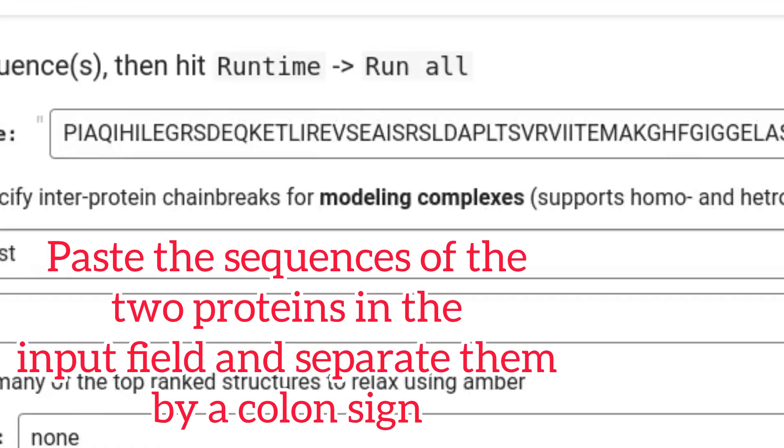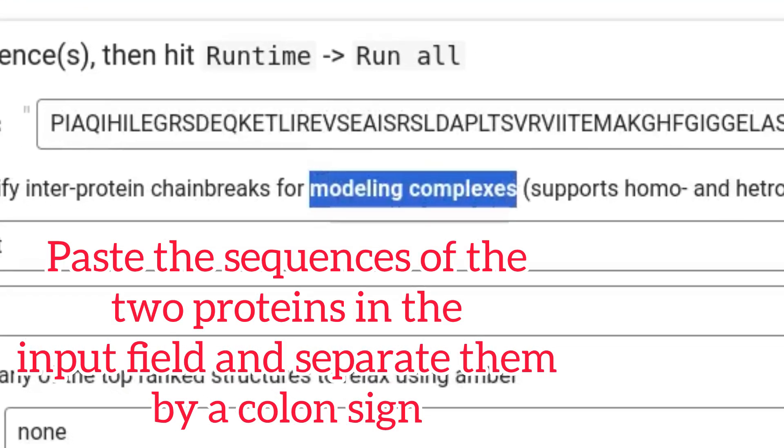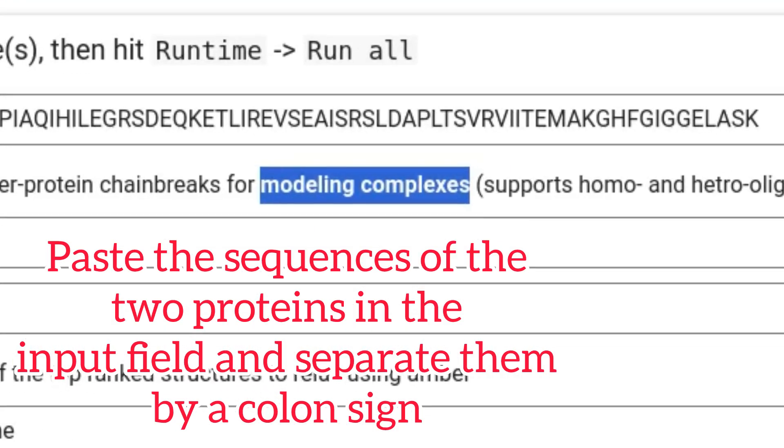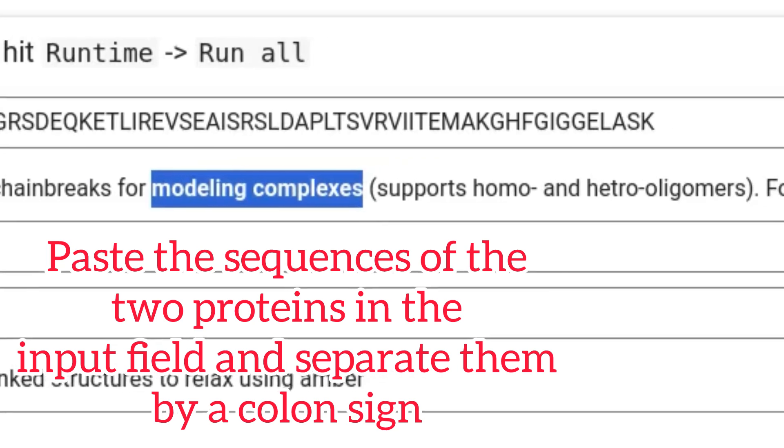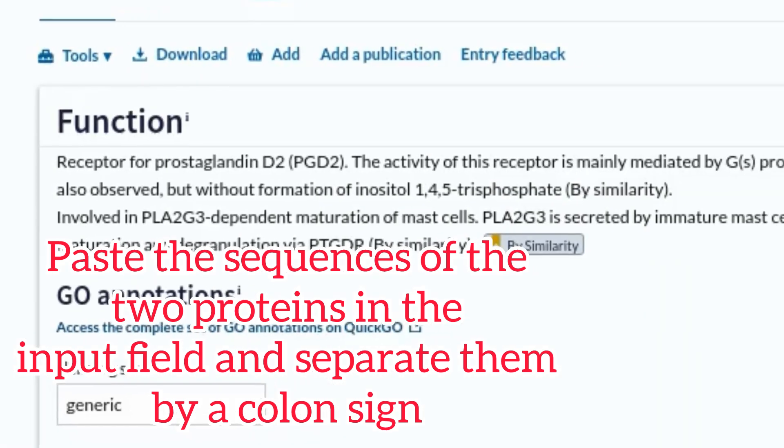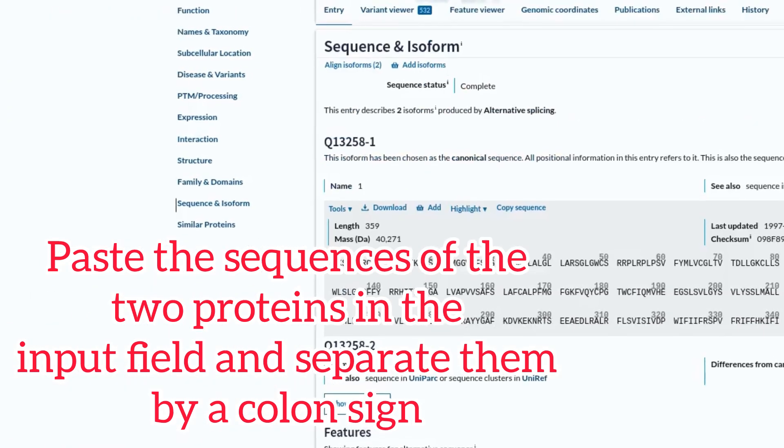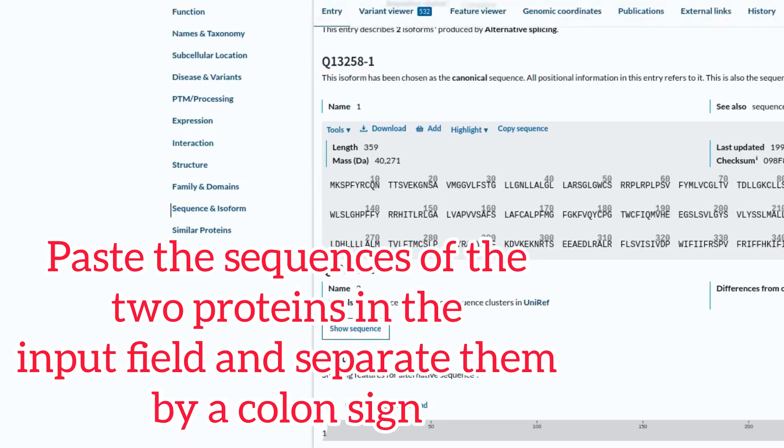Paste the sequence of the two proteins in the input field and separate them by a colon sign.